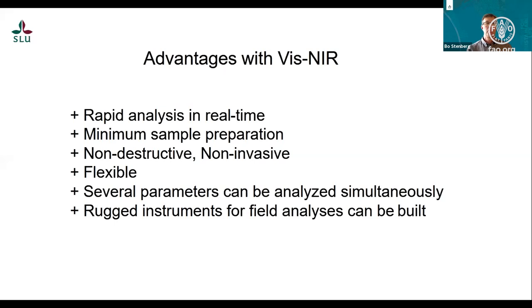The instrumentation can be built very flexible. You can get almost any way to present your sample to the instrument, or vice versa, depending on which instrument you use. And some instruments you can use very many different sample presentation techniques. And in addition to being flexible, the instrument can be built very rugged and durable. So you can use an instrument in the field, you can put them in a tractor, you can put them in an airplane, you can send them up in a satellite, and that is done too. And of course, once you have the spectrum and you need a calibration, we will get back to that. You can analyze several different properties of the soil from one single spectrum, but with a few buts.